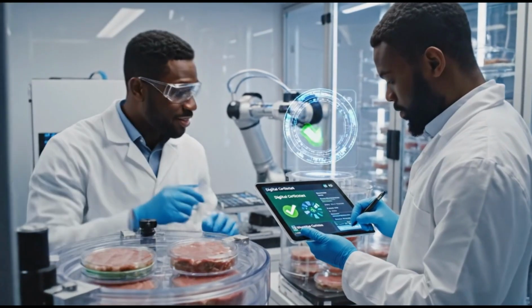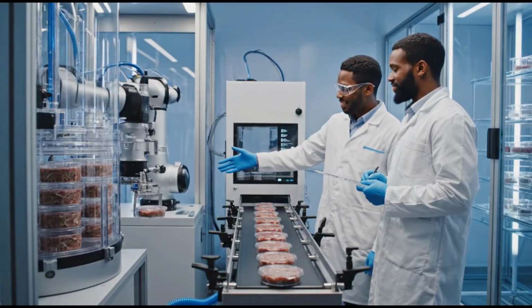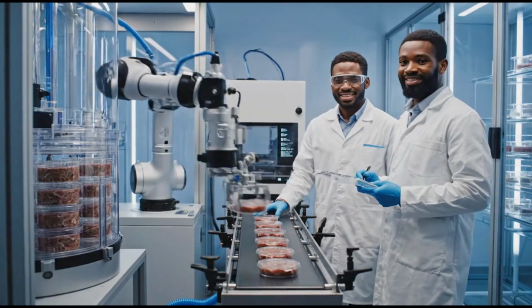Final approval granted for all tested cultured meat. Digital certificates confirm compliance with safety standards. Samples cleared for packaging and distribution.